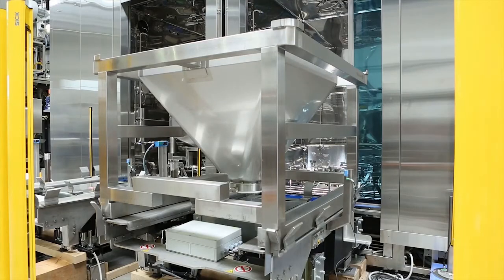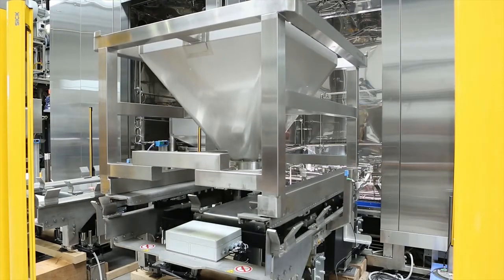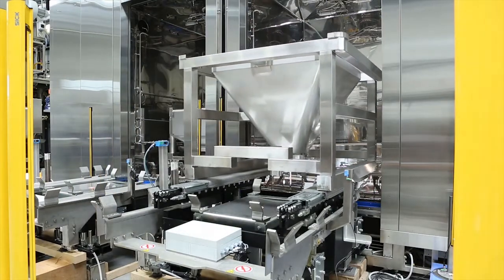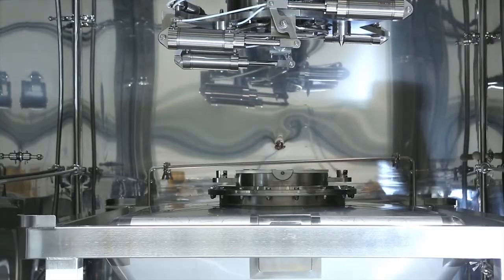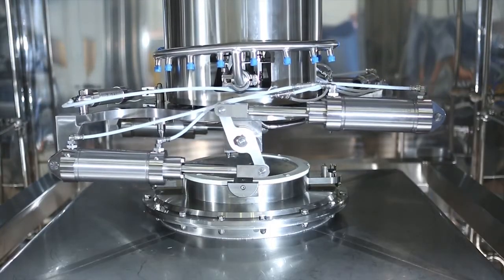The horizontal glass doors open and a container can be maneuvered inside the washing chamber via the automatic loading table. When the container is safely positioned inside the washing chamber, the internal container cleaning and docking system can approach the container's upper passive part.